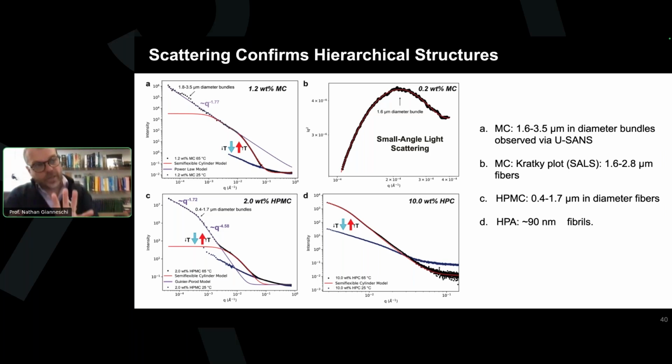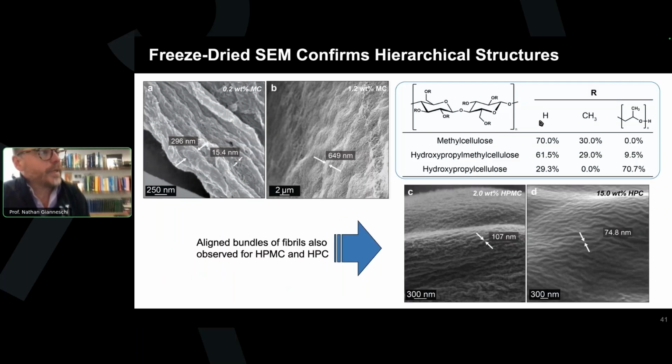So by correlating these bulk scattering approaches, ultra small angle neutron, the X-ray data, plus SEM data, all instigated by these really beautiful structures that we're able to observe by liquid cell TEM, we at least suggest that the small 20 nanometer fibril is not actually the gel forming unit. That is to say, if we had all this data for all of these types of materials, we might learn something deeper about how the gels are formed.